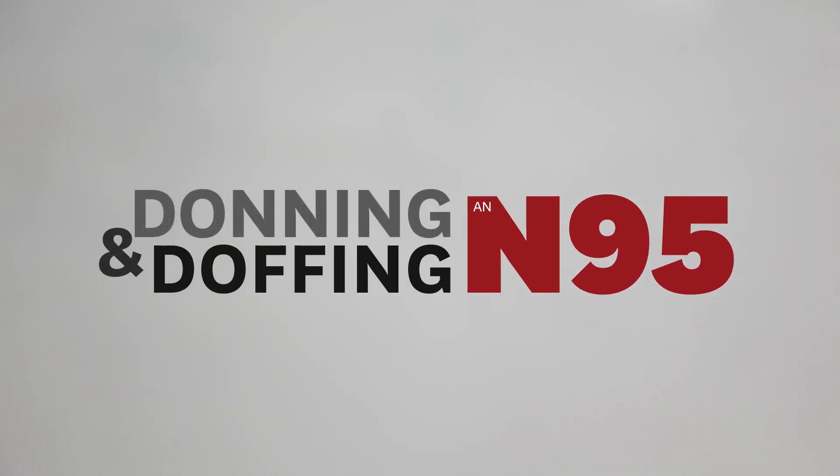In this video, you will learn how to safely don and doff an N95 respirator.